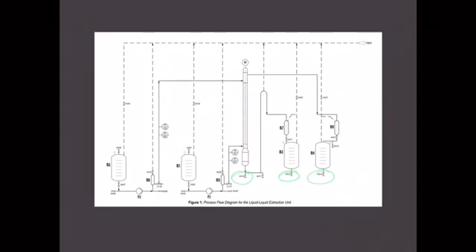By opening HV12, HV14, and HV16, you can drain all liquid from the equipment to the waste tank. Next, switch on pump 2 to wash the column until it is clean. Then open valve HV16 to drain all liquid from the column to the waste tank.